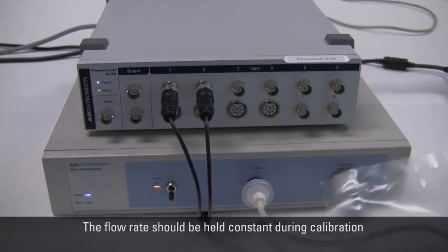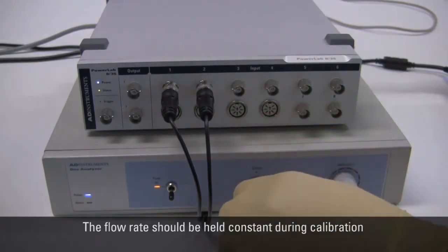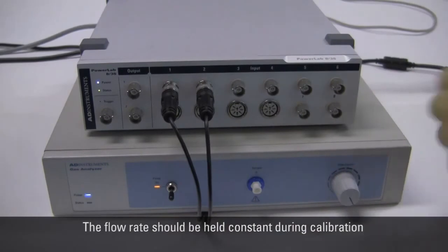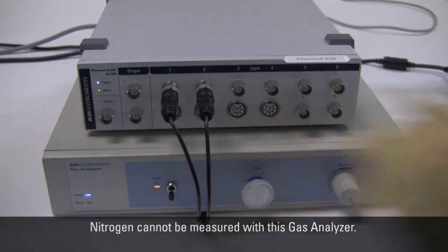The flow rate of the sample gas should be held constant during calibration as the CO2 reading is affected by the pressure and flow rate. Please note that nitrogen cannot be measured with this gas analyzer.